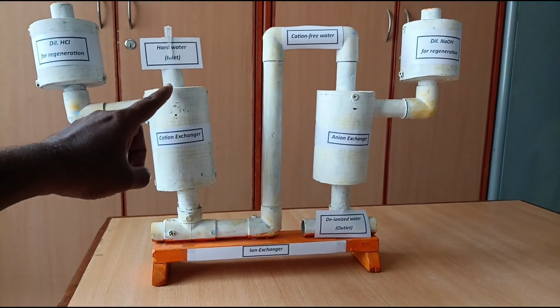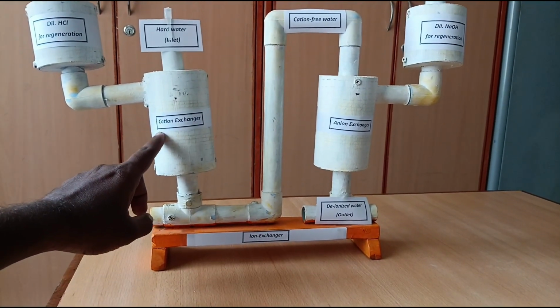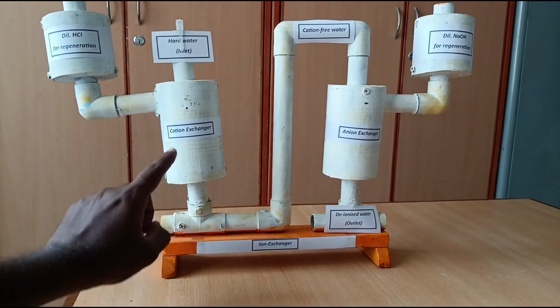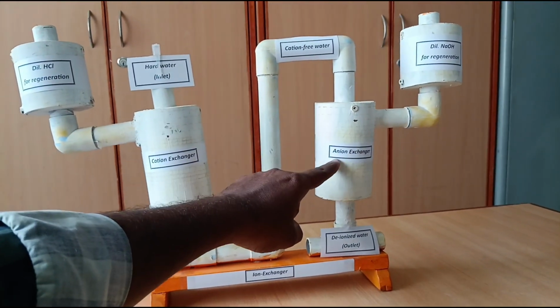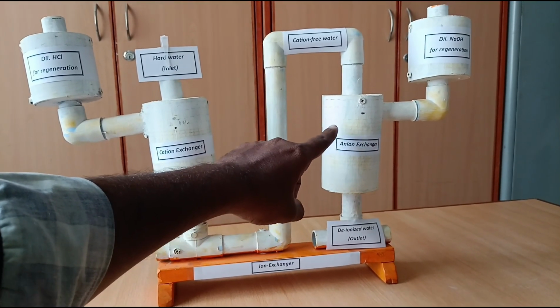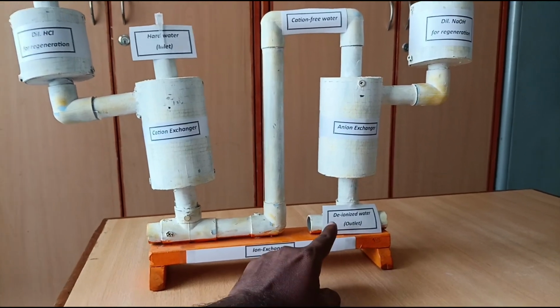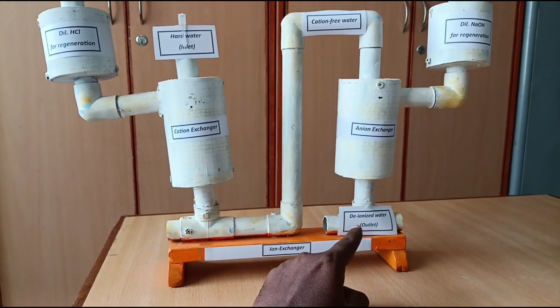When the hard water is allowed to pass through this cation exchanger column, all the cations are absorbed by this cation exchange resin, which is present inside the cation exchanger column. The cation free water is then allowed to pass through this anion exchanger column, where all the anions are absorbed by anion exchange resin, which is present inside the anion exchanger column. The outcoming water is completely free from both cations and anions. That water is called deionized water.